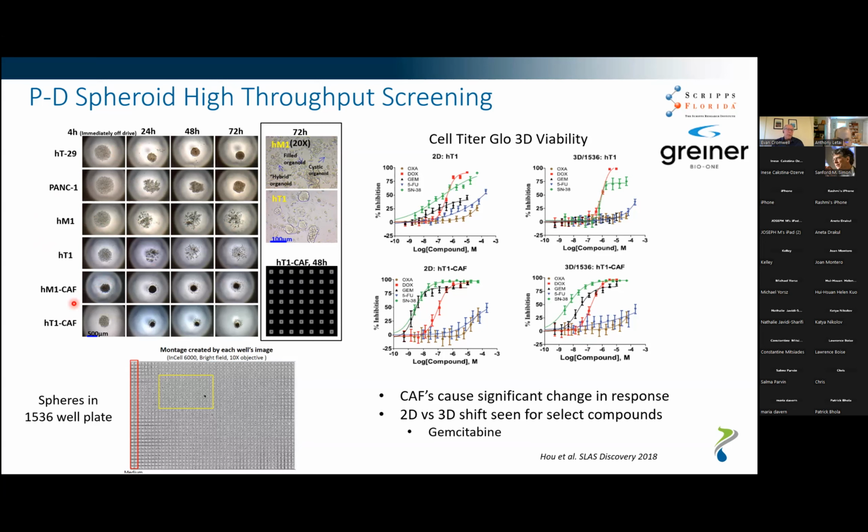He added in the cancer-associated fibroblasts, and then was able to see a very cohesive 3D cell model form over a 72-hour period. And so the introduction of these multicellular components into the dish was really critical for him to form a good model for doing the screening.